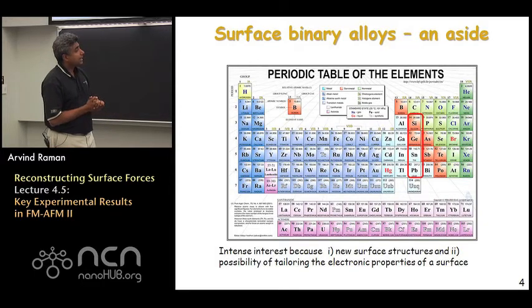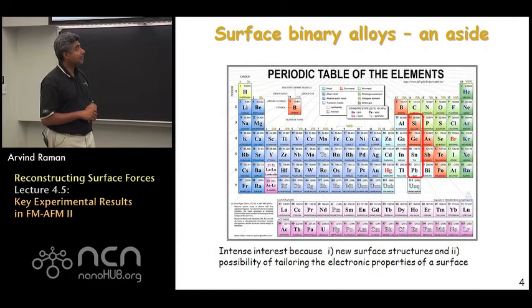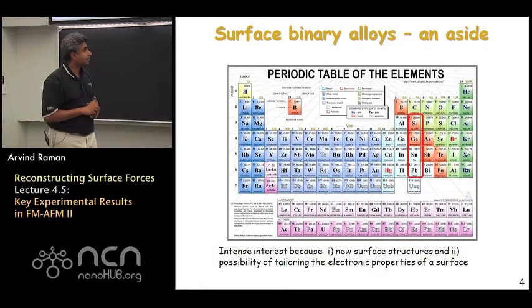So the idea that one can take a silicon surface and then just evaporate atoms from germanium, tin, or lead on it, heat up the surface, and cool it back down, and the atoms that were evaporated completely integrate themselves into the silicon surface, completely changing lattice constants, electronic properties, all within a very thin thickness of the surface.